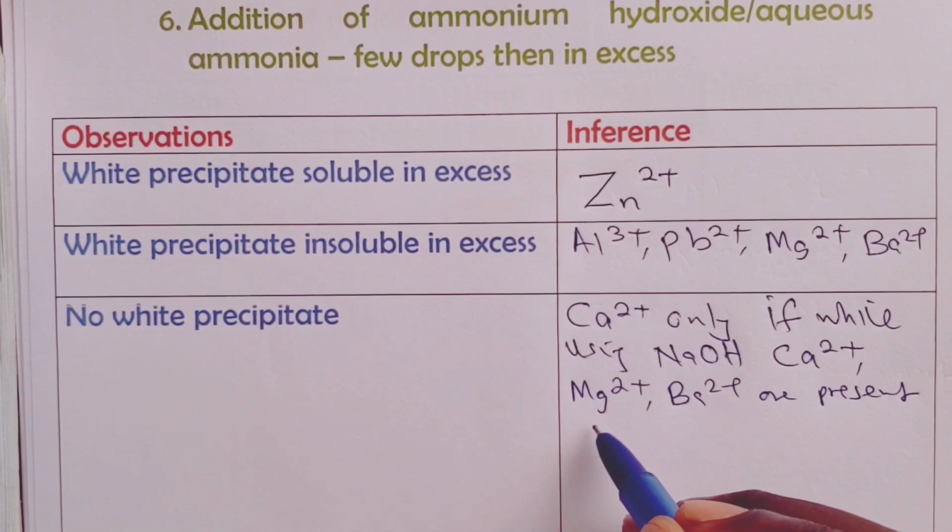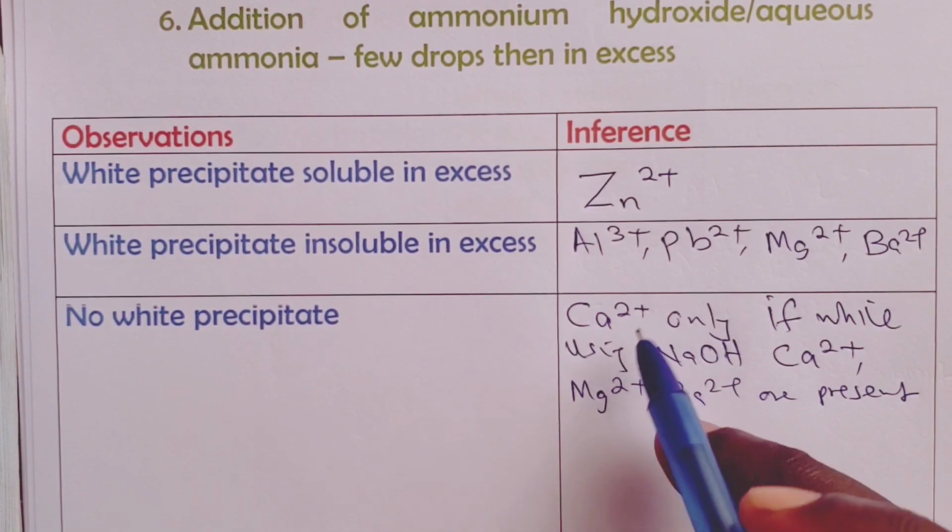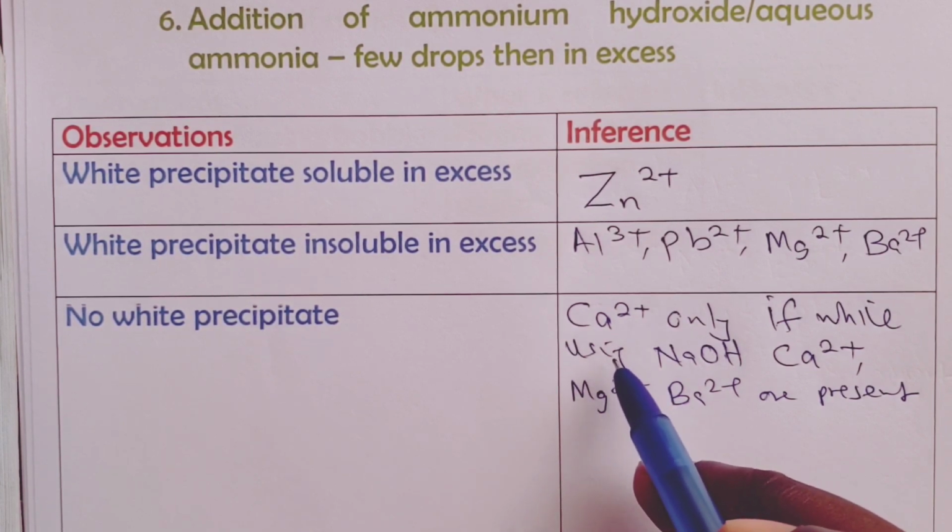So that is the only case where we shall accept calcium as being present here.